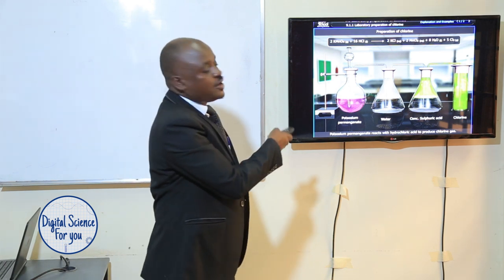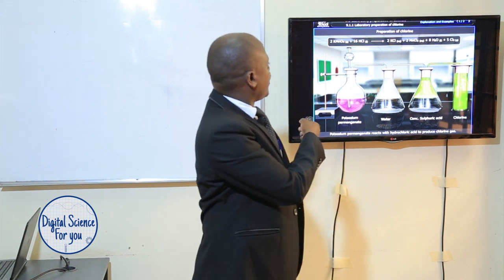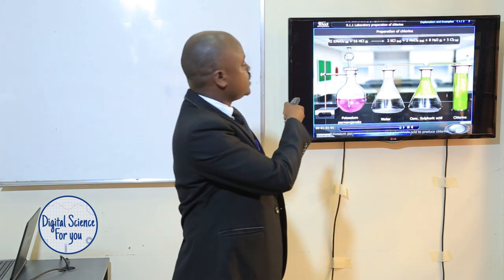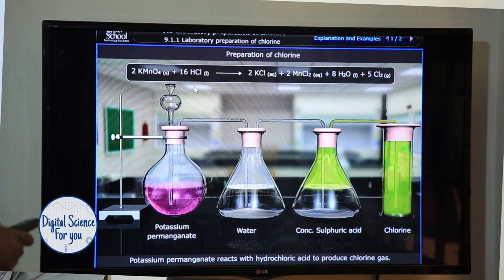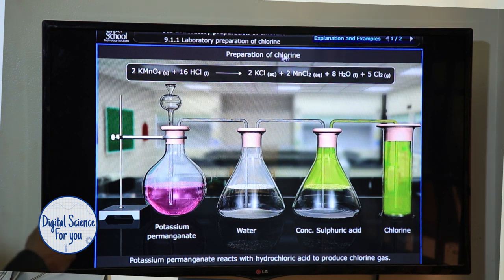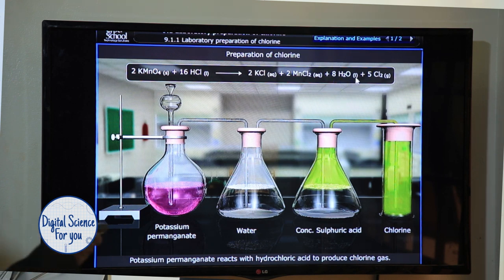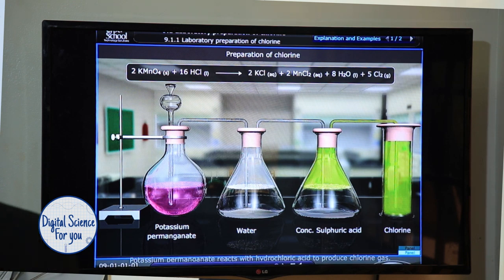Now I want to emphasize the equation for the reaction. We can see our reactants: potassium permanganate, which is in solid state, reacting with hydrochloric acid, which is in aqueous state, giving us potassium chloride — which remains in the round-bottom flask — and manganese(II) chloride, which also remains in the flask. Then water, which we have to dry using concentrated sulfuric acid. And then chlorine, which we have now collected in the gas jar.